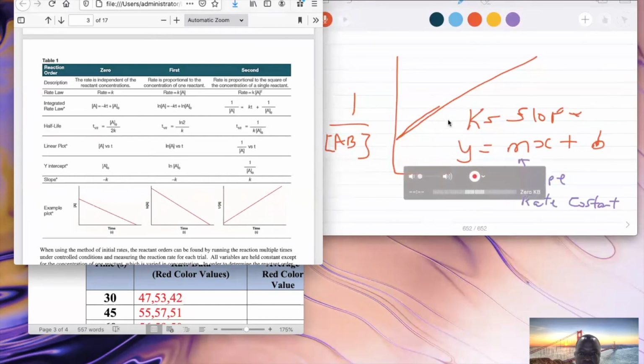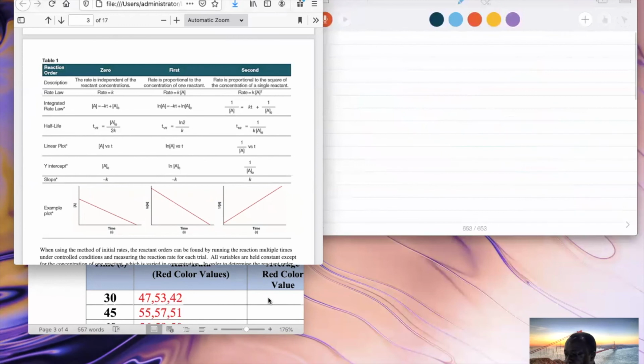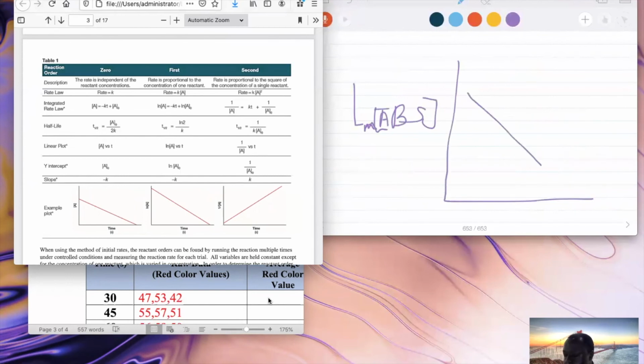So if in part 1, I had 1 over absorbance as positive, then this part also will be 1 over the absorbance value. If natural log of absorbance APS is on the y-axis over time in part 1 tested positive like that, all right, then I'm just going to have that slope, and please make it positive.